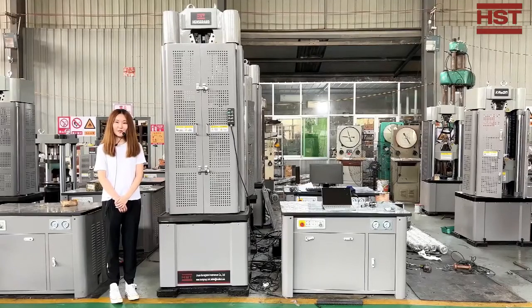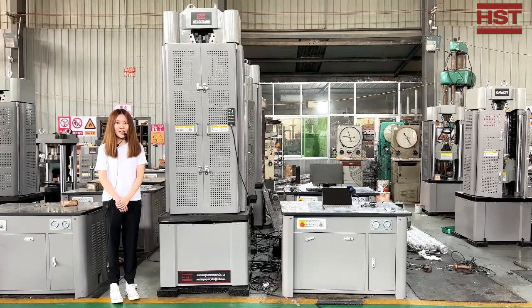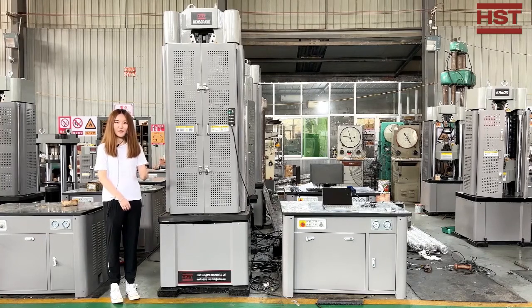Hi everyone, this is Grace from HST Group. Thanks very much for purchasing our Hydraulic Universal Testing Machine. Our company is the leading manufacturer of producing all kinds of testing machines. Today I'm going to show you how to operate this equipment after you receive the package.